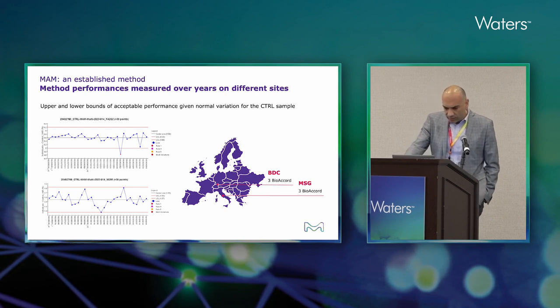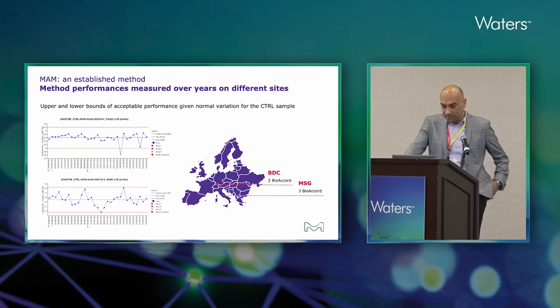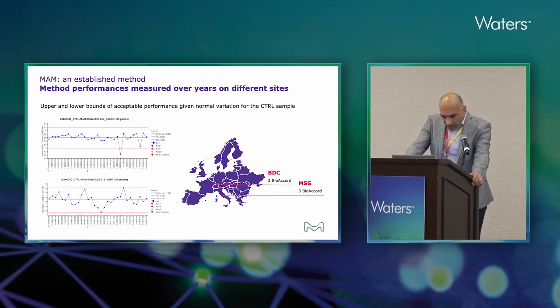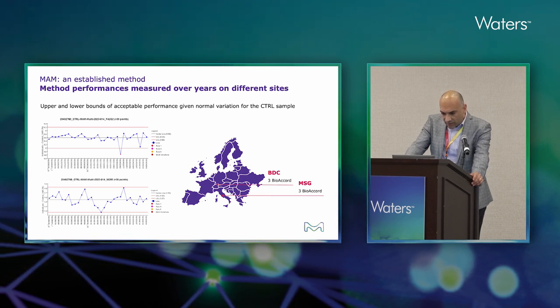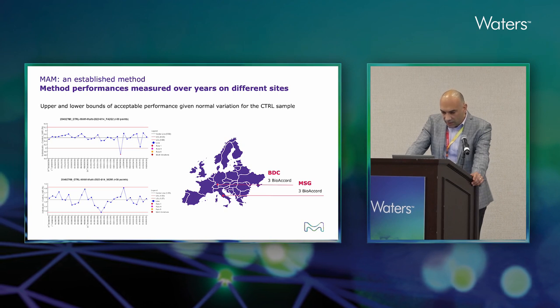It's hard to read, but there are 2 control charts for one of our controls that we add at each analytical sequence. The first one is the FA2G2 glycopeptide. The control chart is based on 3 standard deviations that are calculated after 30 data points acquired.